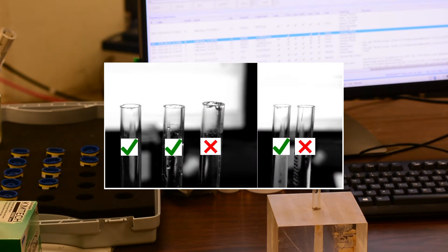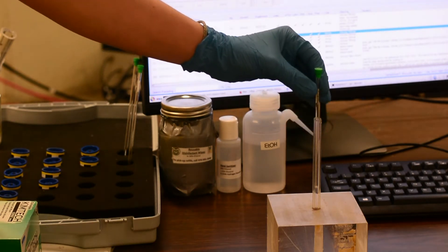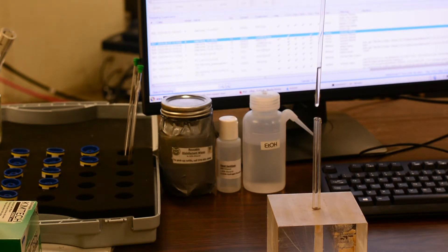If you're concerned your tube may be warped, you can check it in the gauge at the MMA. If it slides freely into the gauge, then you know it's not warped. If it gets stuck anywhere along the way, then you'll want to replace that tube with a different one.